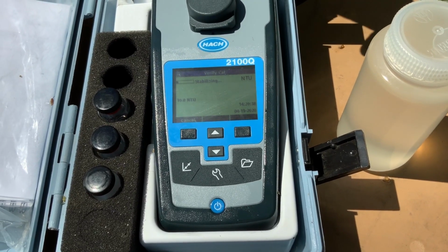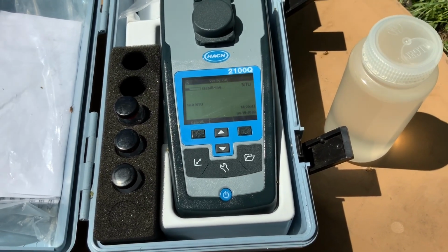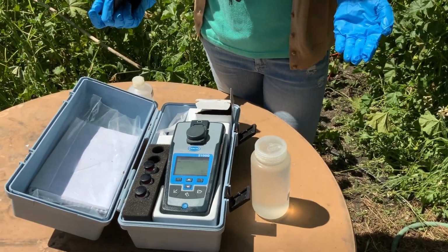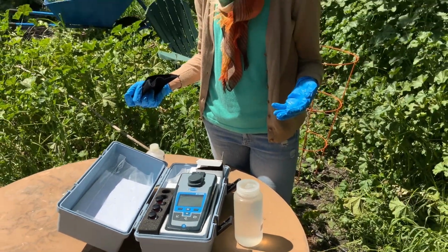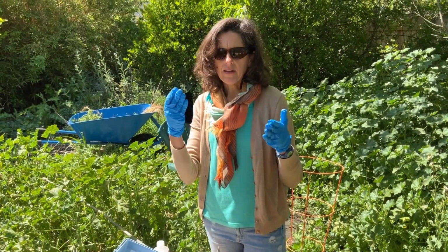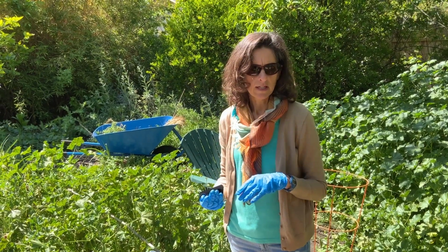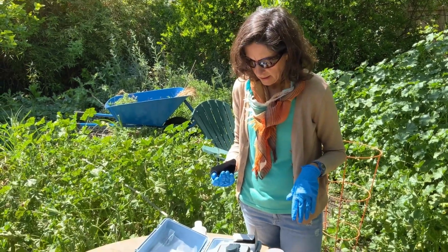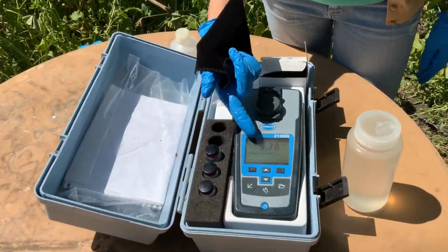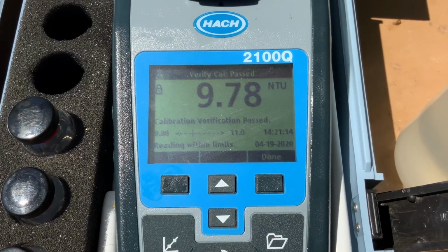Now, we only do that verify cal step when we're verifying the calibration solution. And it should read somewhere in between 9 and 11 NTUs, which are Nephelometric Turbidity Units. If it's between those, then it's within 10%, and that'll be okay, because that's as good as this machine can get, about 10% accuracy. It's nice if we're even closer, but we're at 9.78. So it says calibration verification passed, and that means we can go on with making our sample.